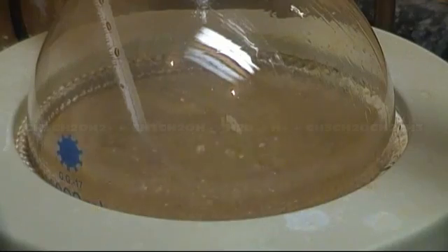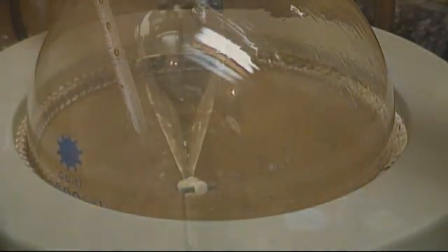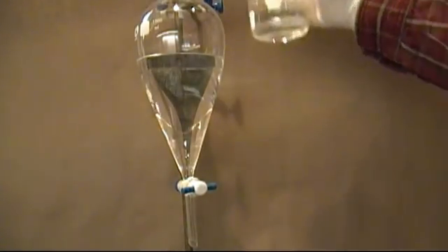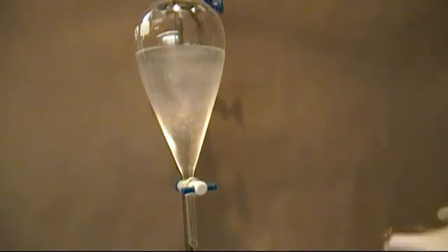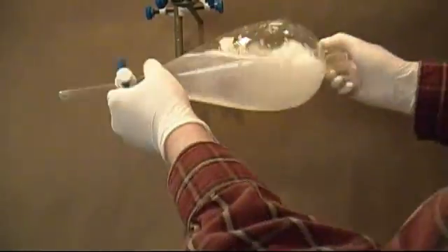I ran 500 milliliters of ethanol through the addition funnel, and then let the reaction run for about 15 minutes after everything was added. When done, I poured all the distillate into a large separatory funnel. To the separatory funnel, I added about 200 milliliters of a 10% sodium hydroxide and water solution to remove any acid. I shook thoroughly, venting often.